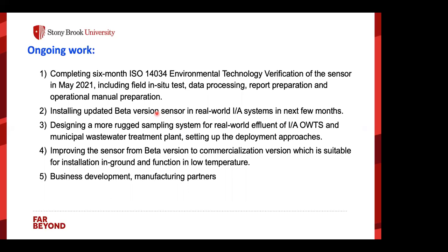I'm planning to perform the second maintenance, maybe this week or next week, to take a look at what's going on. Is there any biofilm formed in the sampling system? Is there any potential clog in the flow system? Right now, I don't know that. I need to open the box and take a look inside. So far, so good. The data I download and observe each day is very nice.